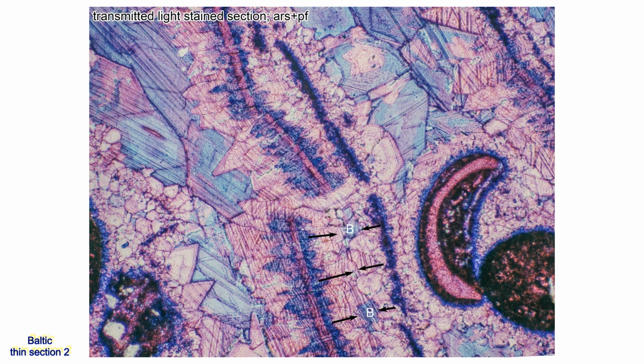At the top of this image, the bivalve's micrite and calcite layers come closer together, for after the original aragonite layer had dissolved, these layers, being unsupported, collapsed towards one another, accompanied by localized fracturing.